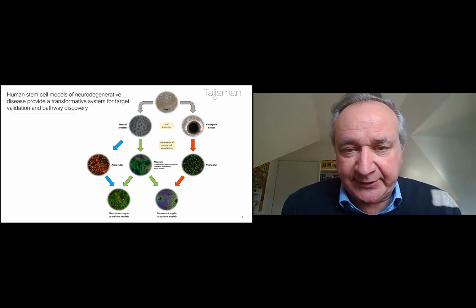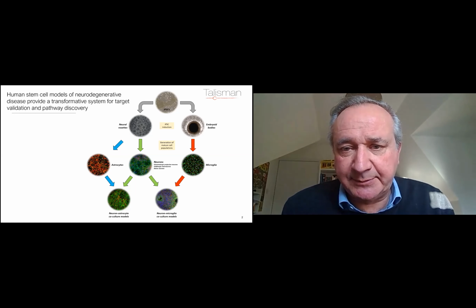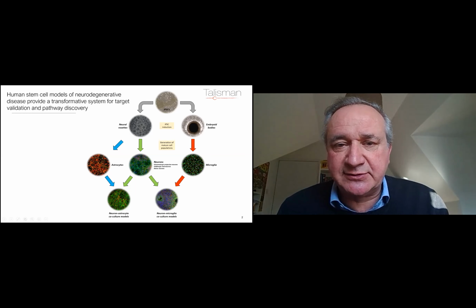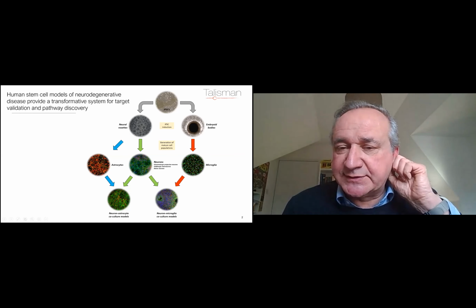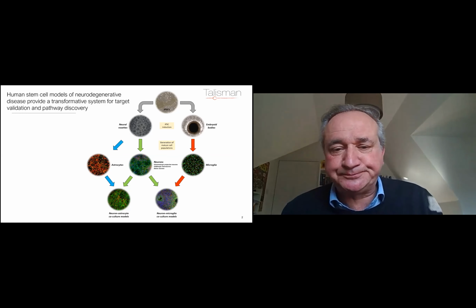And you can take iPSCs and either make what we call neural rosettes. That means they have a neuronal or glial phenotype, or down an alternative pathway, which you can see here, and hopefully you can see my screen here. Here's the neural rosettes, and here's the other pathway that leads to microglia, or the resident inflammatory cells in the brain. So in some ways, they're equivalent to macrophages in the periphery.